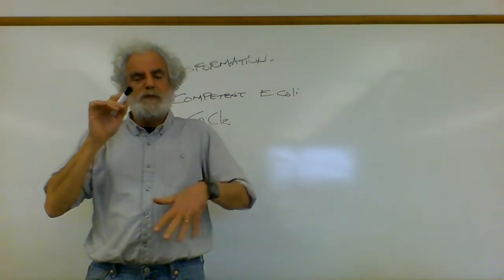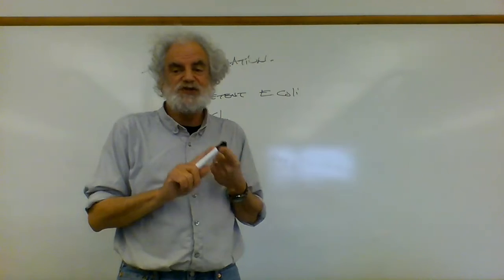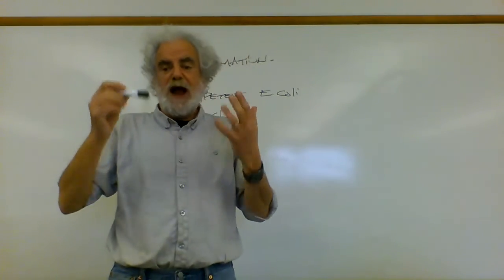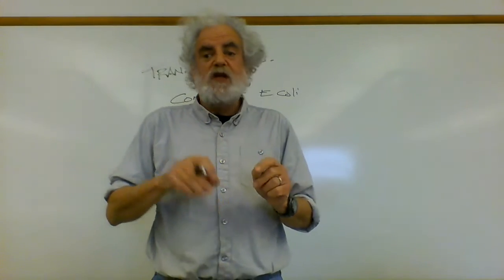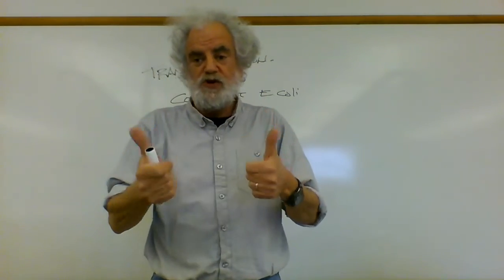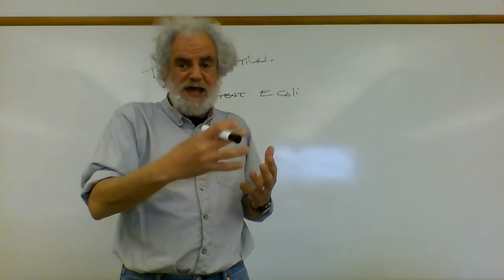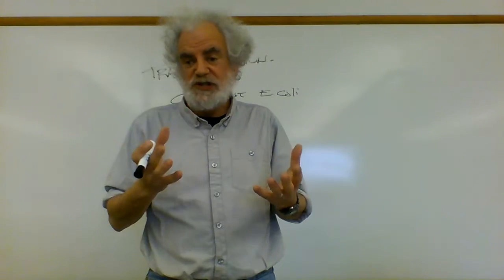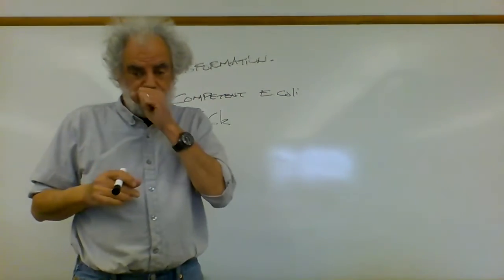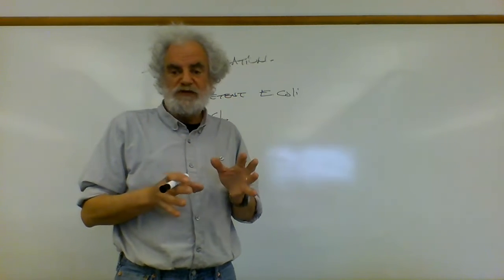Now, as we'll see as we talk, what we're going for is the highest transformation efficiency, the number of colonies per microgram. That is our number. The more colonies you get, the better you are. The more colonies you get depends on how competent your cells are. So, there are a lot of different ways to make competent cells.